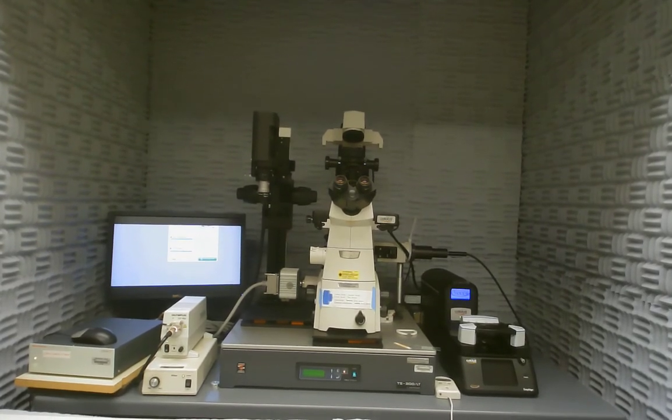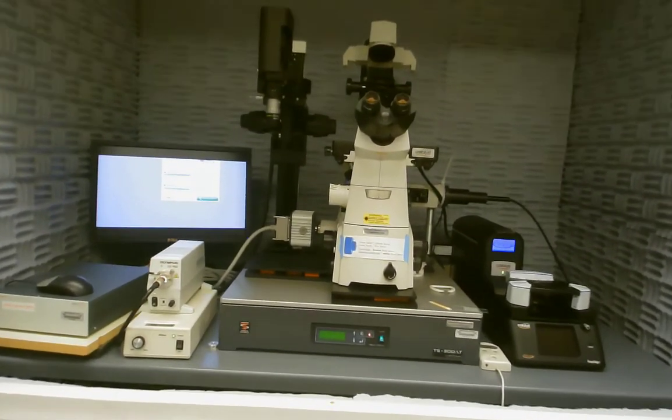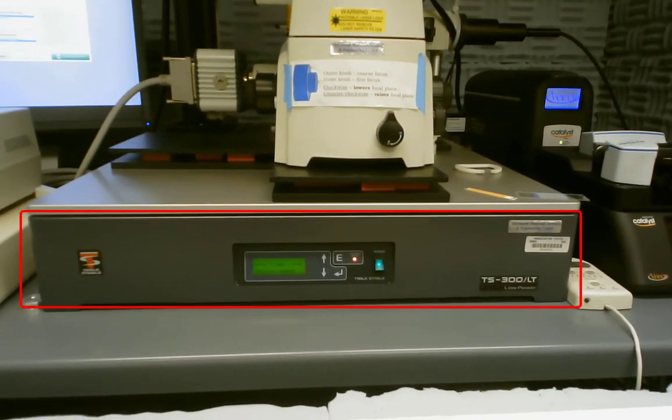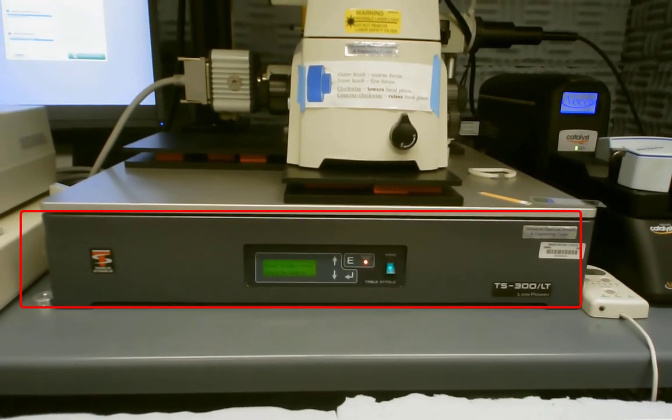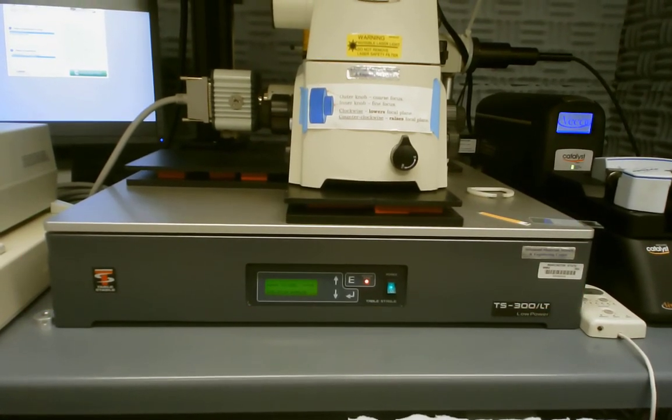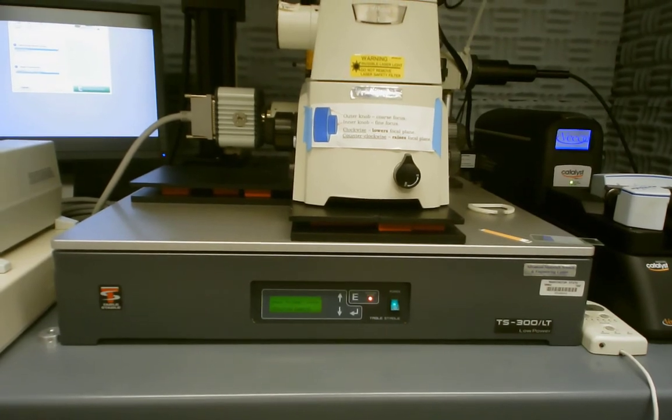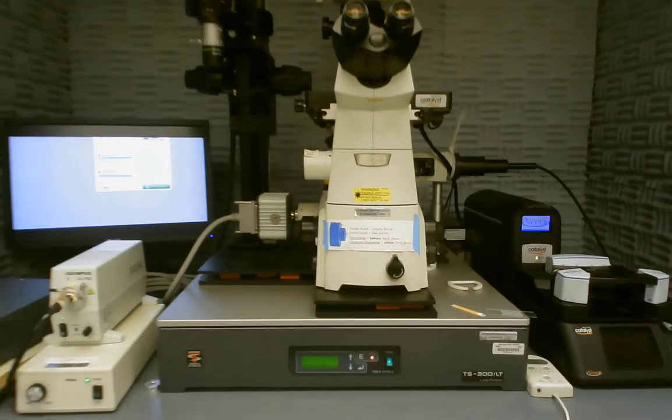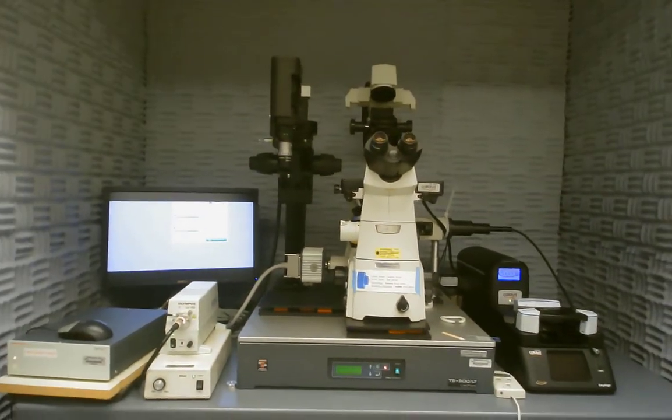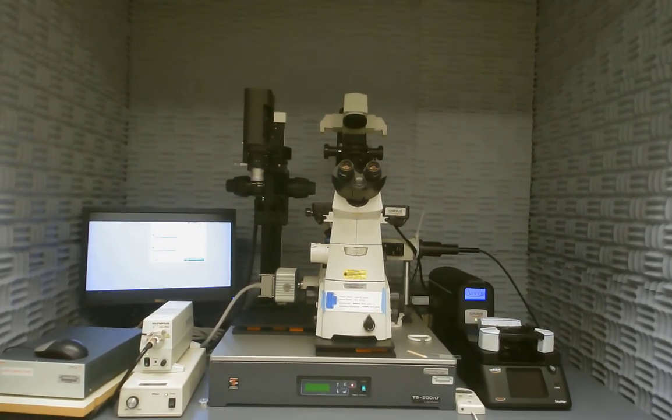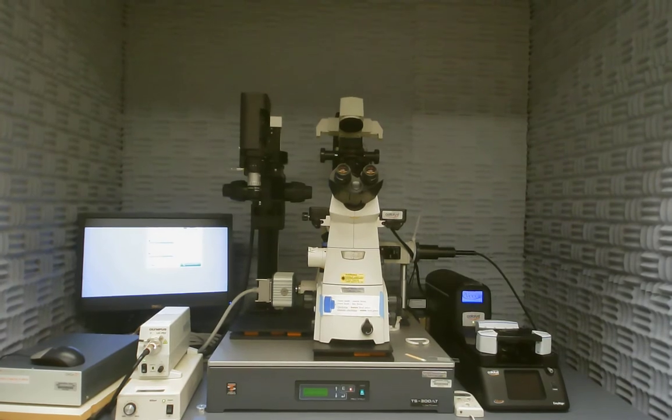Another thing to notice is that the system is set upon a vibration isolation table. So this isolates the system from any vibrations that the building may be contributing so that they don't affect our measurements. AFM measures very, very, very small features on the order of nanometers. And therefore any vibrations may affect our measurements greatly.